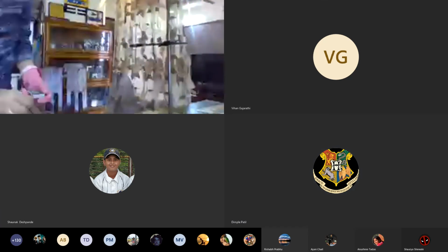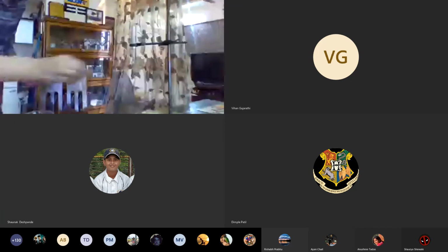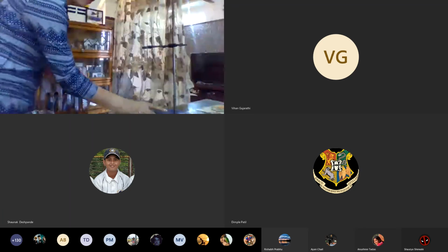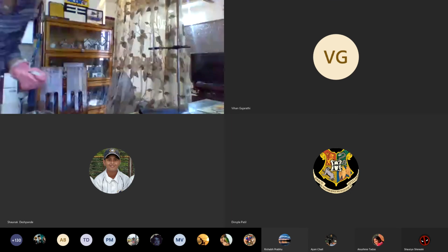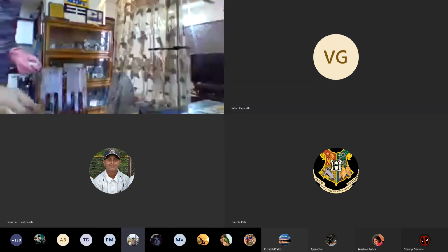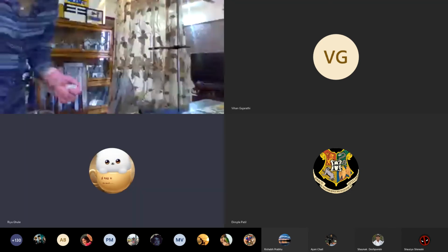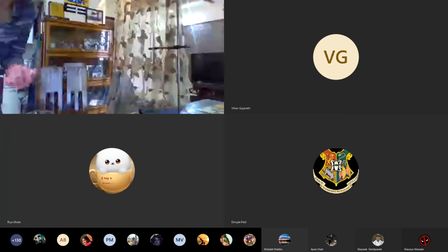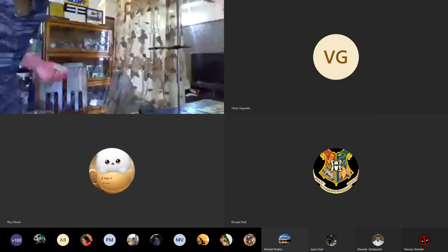Okay. Now the reaction again, it is going to be violent, and let me keep it away from my laptop. Is this view okay? Yes, ma'am. If the reaction is violent and a lot of sparkles are coming, I might not bring the matchstick near it.